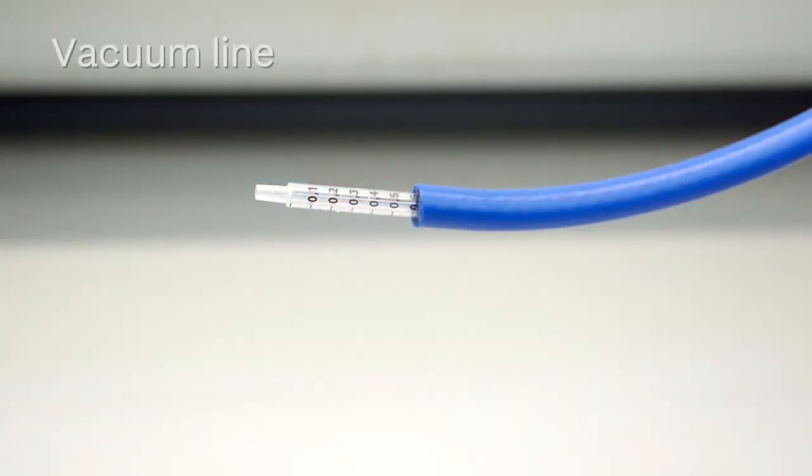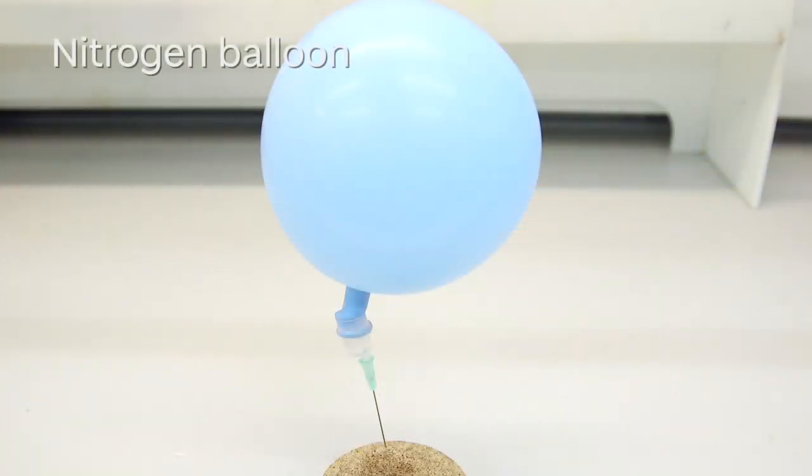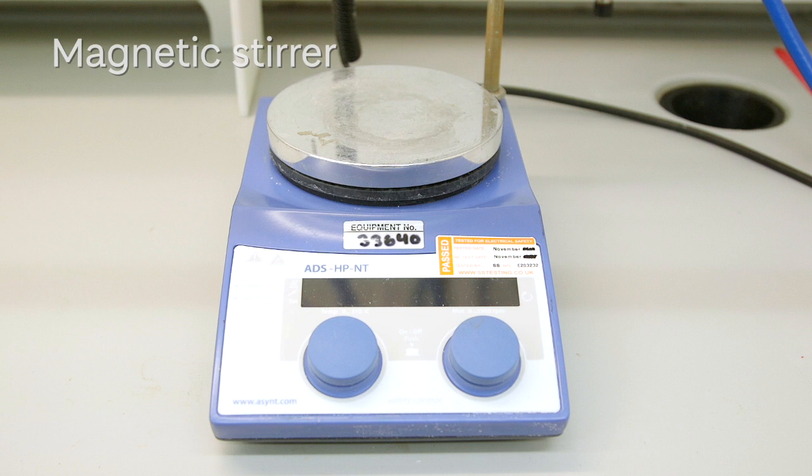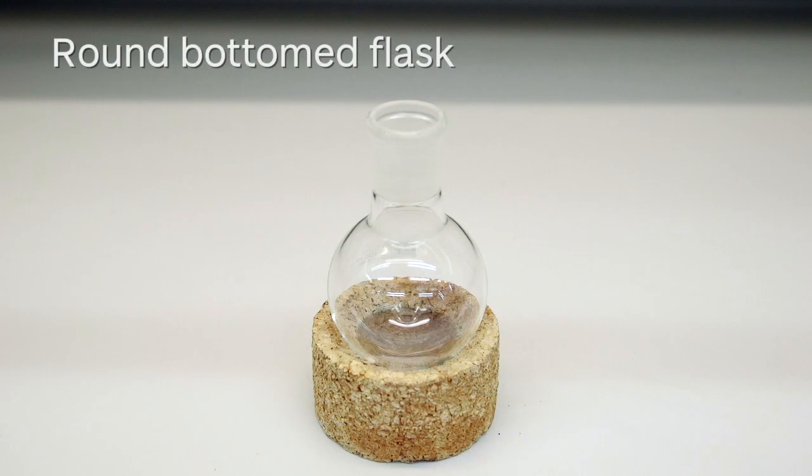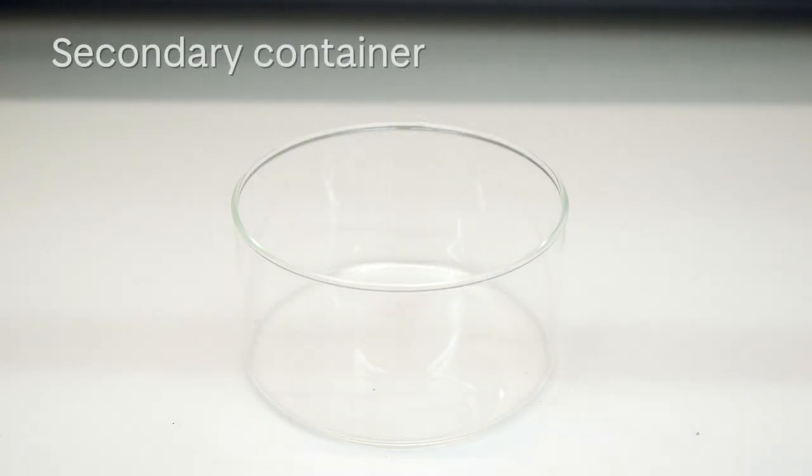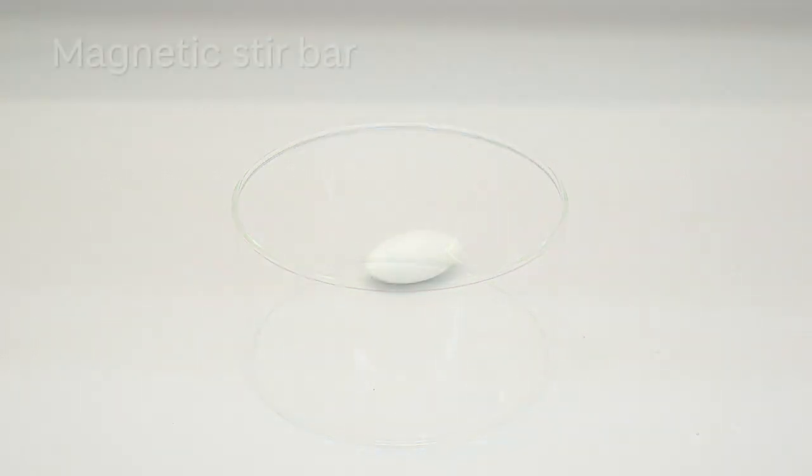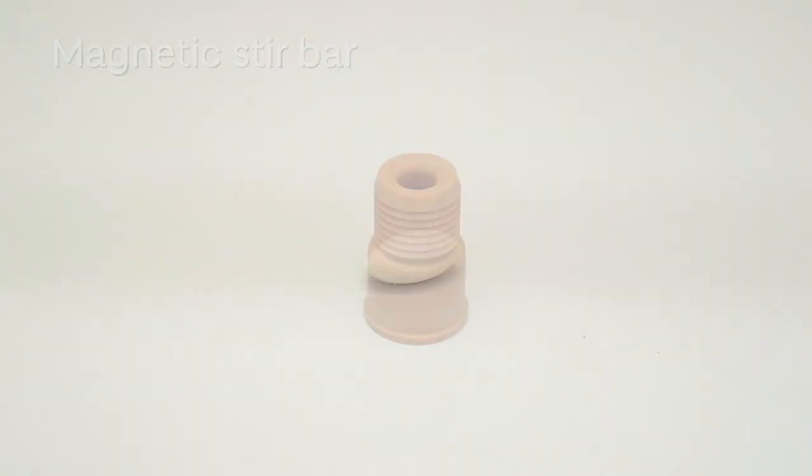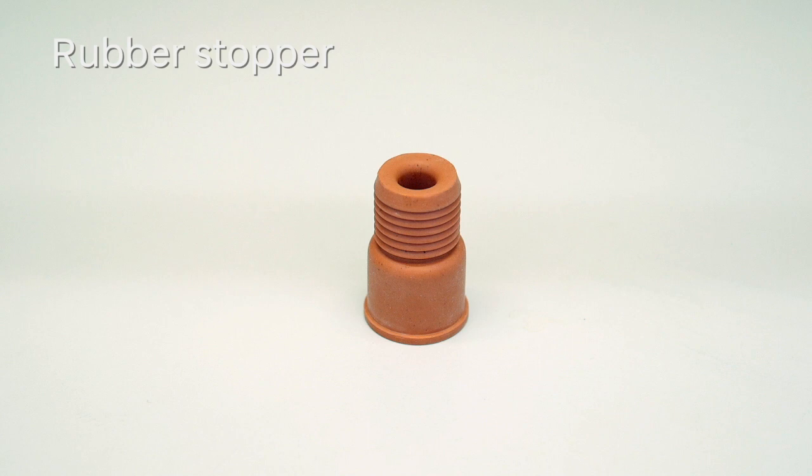For this setup we will need a vacuum line, a balloon filled with nitrogen gas, a magnetic stirrer, a round bottom flask, a secondary container, a magnetic stirrer bar, and a rubber stopper.